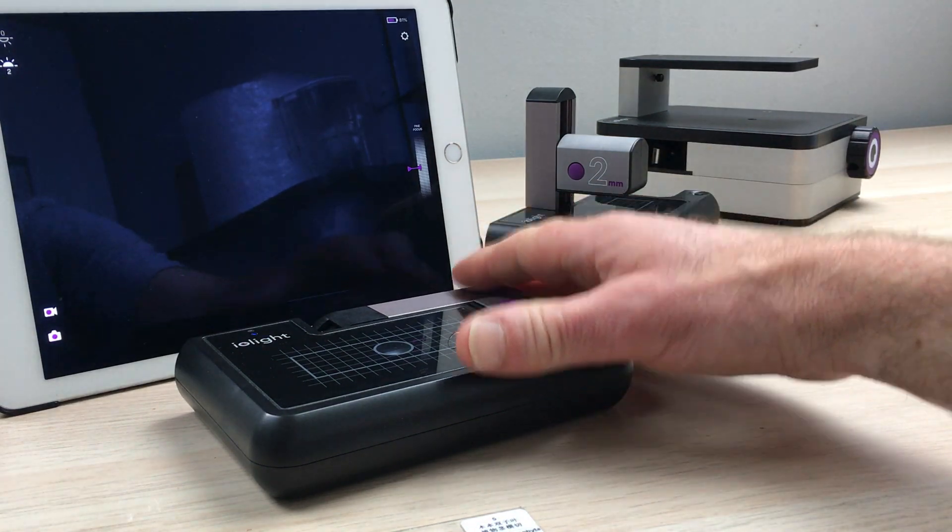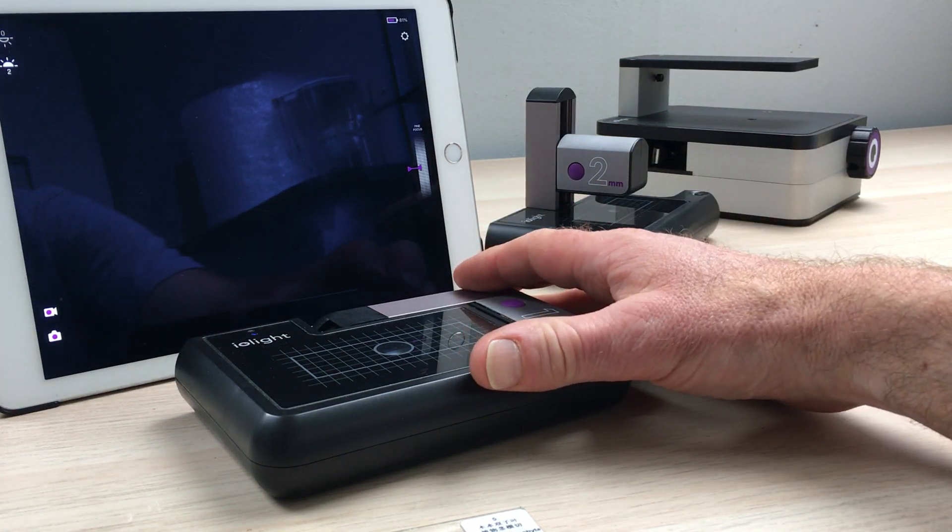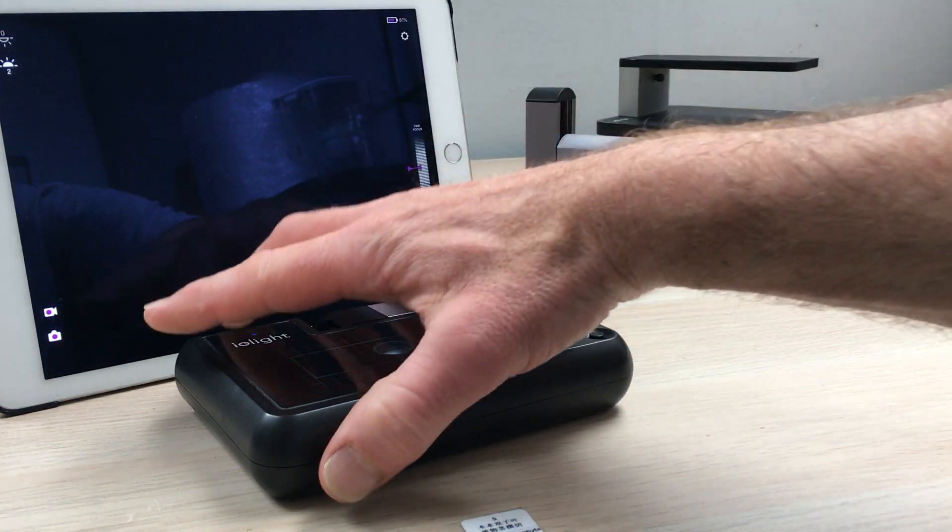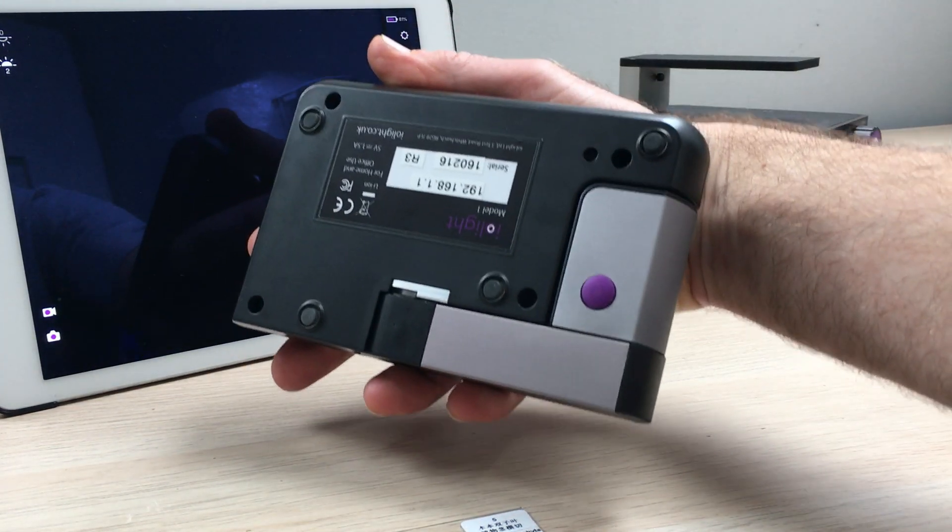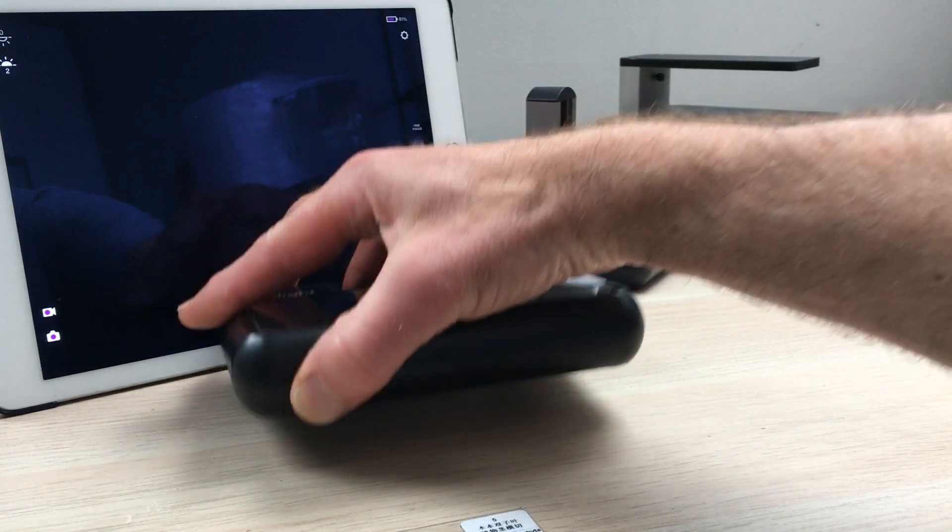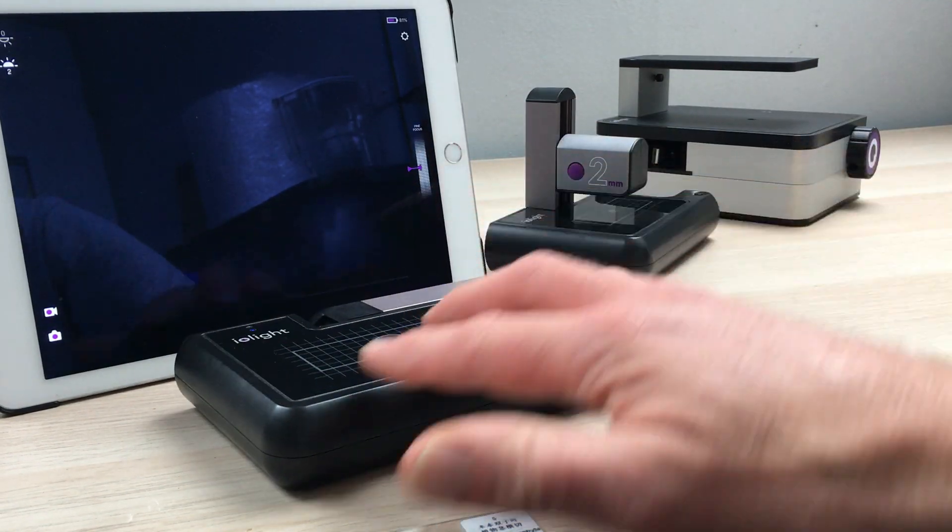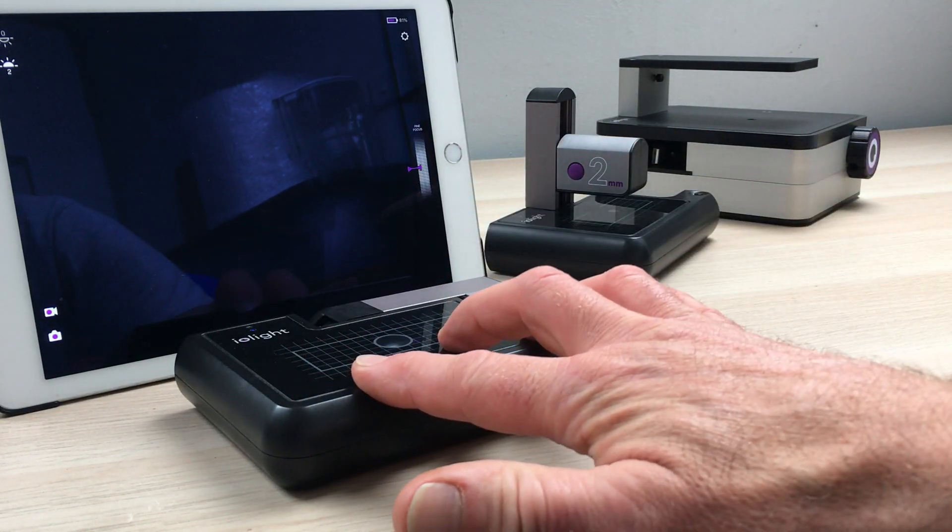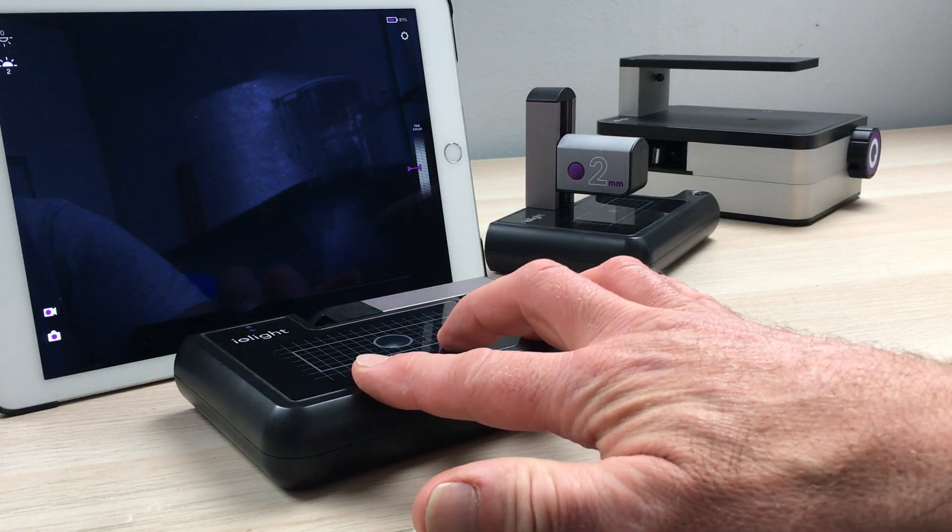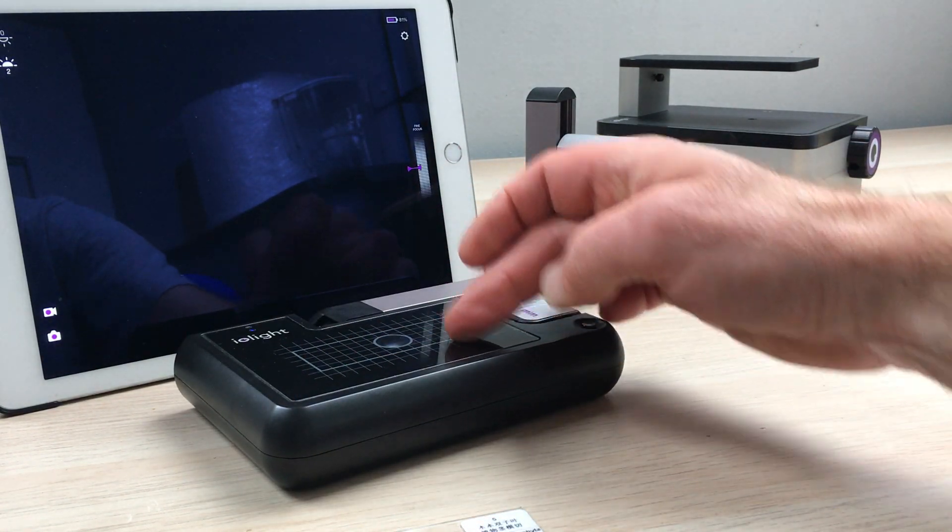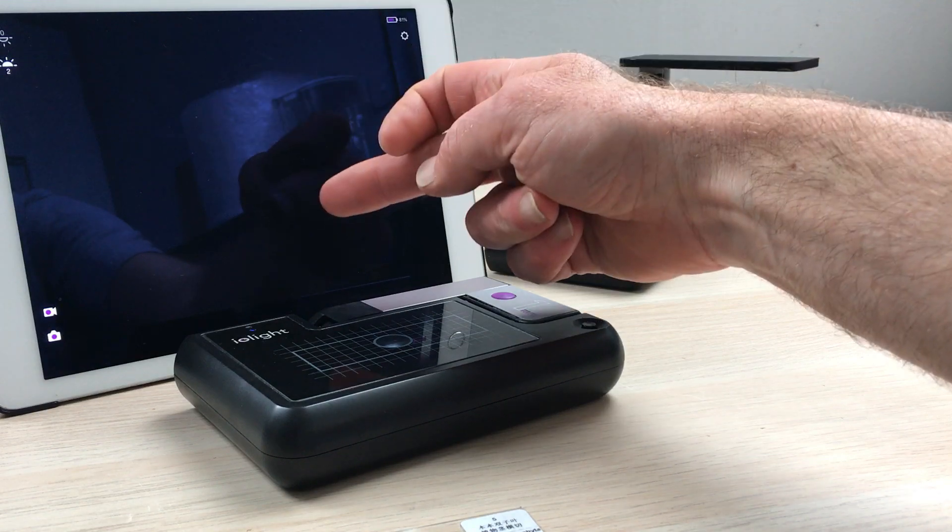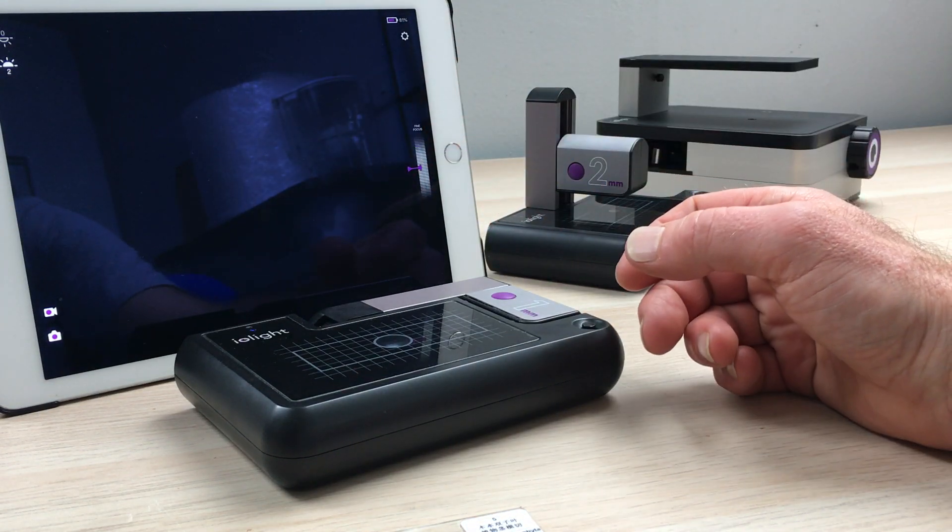They're all small, compact and very easy to use. You'll see this one here easily fits within the palm of my hand. They're also digital microscopes, so they display their images on smartphones, tablets or computers.